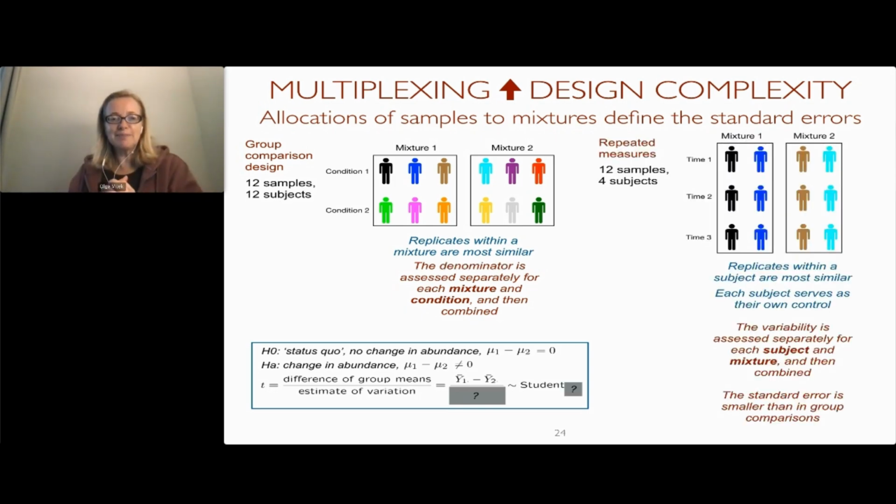What about a time course experiment? What we can do is also have multiple time courses in one mixture, but now we have space only for one person with multiple times in one mixture, and actually 2 replicates, and a second person across multiple times. And then we have more replicates, so we have a second mixture.